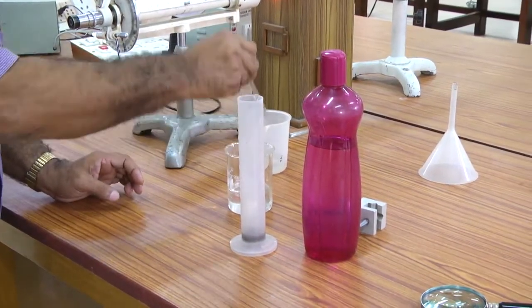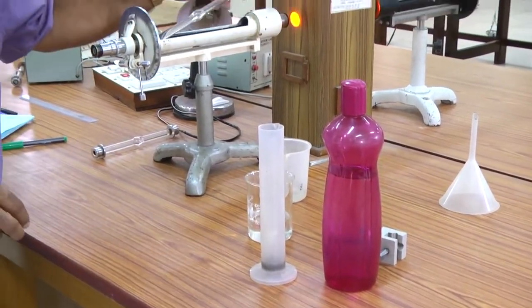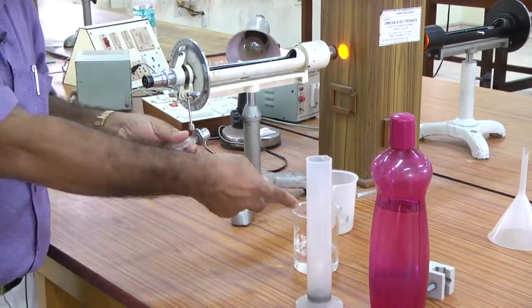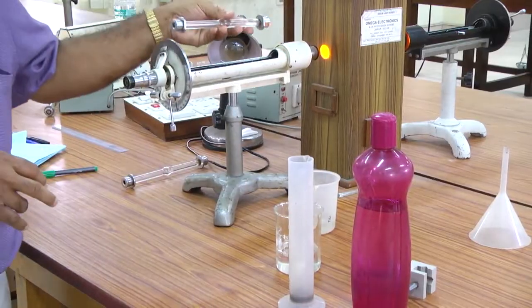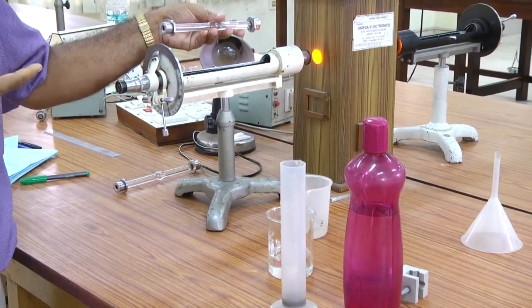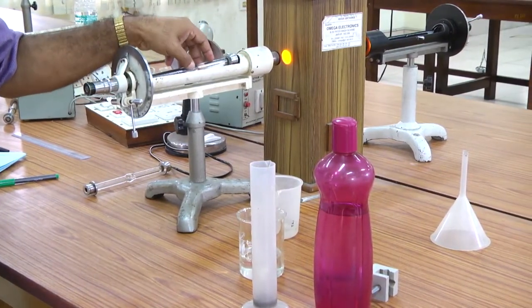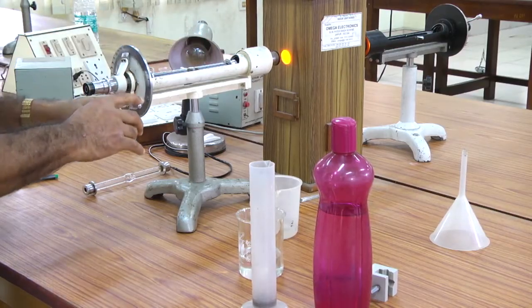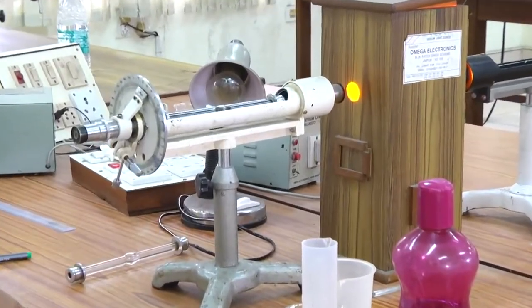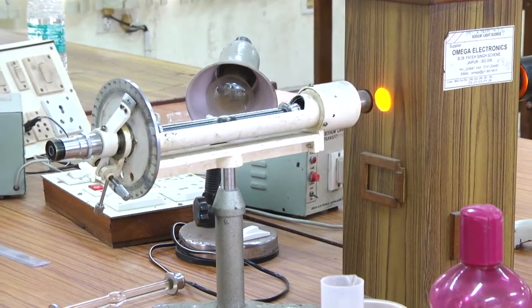Okay. And then you change the previous solution, put in this solution and repeat the experiment. You repeat the experiment for 5 solutions of known concentration, and then you do the sixth one, the same way. So, taking the reading is very easy if you identify the uniform region.